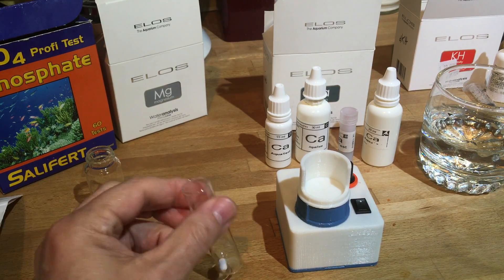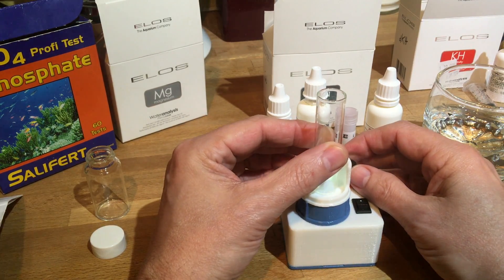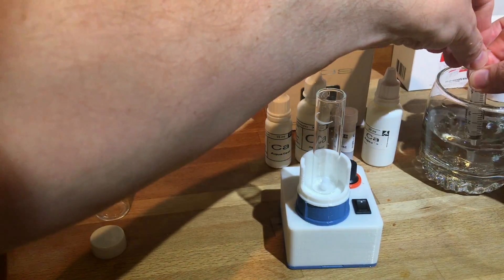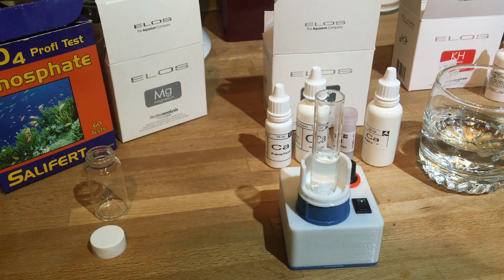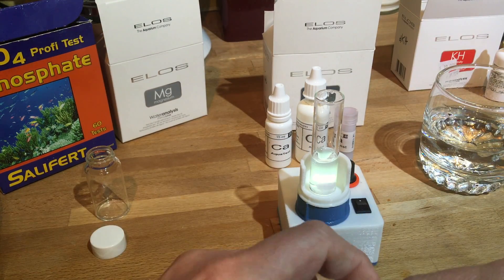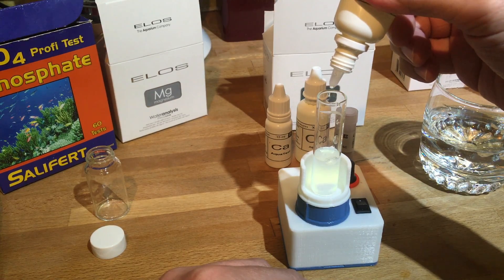This time we're going to do the calcium test and I want to try this little tiny beaker from ELOS — see what it does. Let's just try it with nothing in it first, just the bead and the magnetic stirrer. Okay, that spins and the beaker doesn't go flying — that's a good sign. It says to grab five milliliters of water. Then we need to add seven drops of A. I'm going to turn it on — hopefully keep it centered at a slow spin.